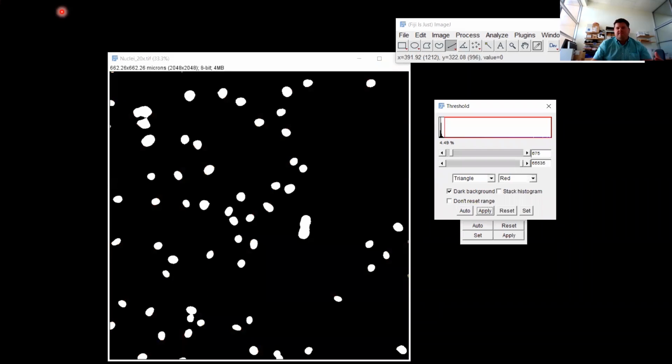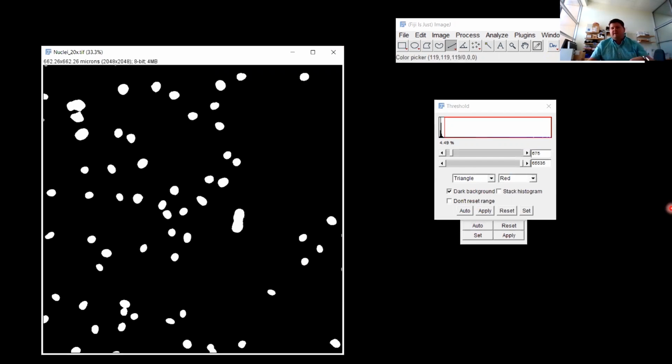I've got these cells, and they also had a green channel where I was imaging Cytox to see if the cells were dying. And so I can do the threshold and count how many objects there are and go, oh, there were 100 cells, and how many of them are green. So I have to take these objects to my green image somehow. And if we look up on my status bar, these nuclei here have a value of 255. And we will do this as a later exercise.